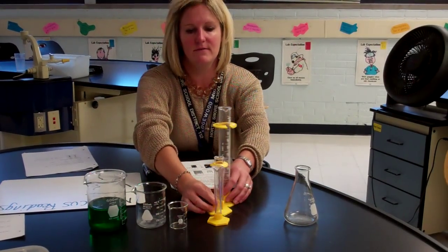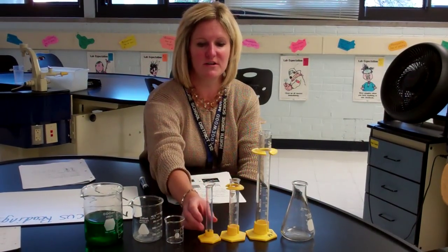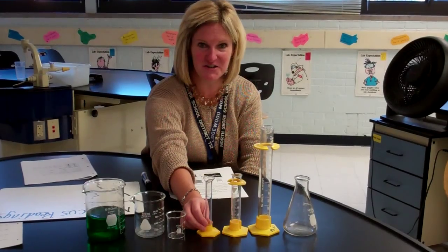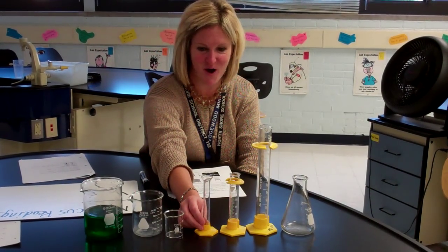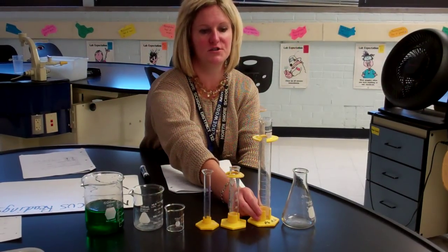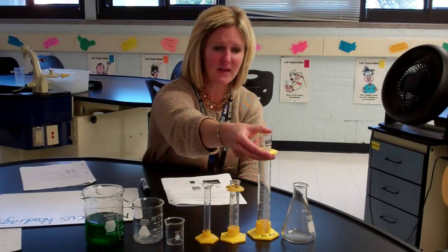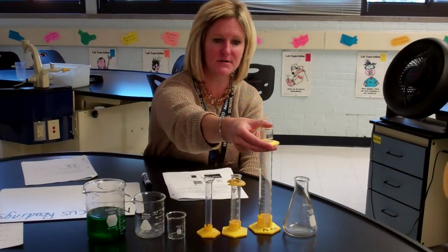We also have graduated cylinders. We have 3 different types of graduated cylinders, one of which is the 10 milliliter graduated cylinder. It's very small. We have the 25 milliliter graduated cylinder and the 100 milliliter graduated cylinder. You may notice here on the top, these are called bumpers.